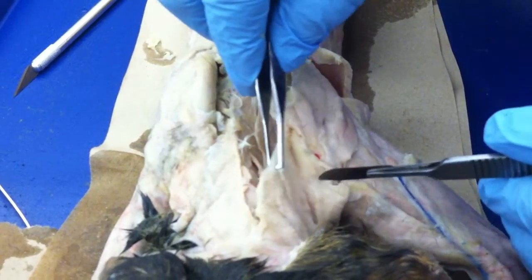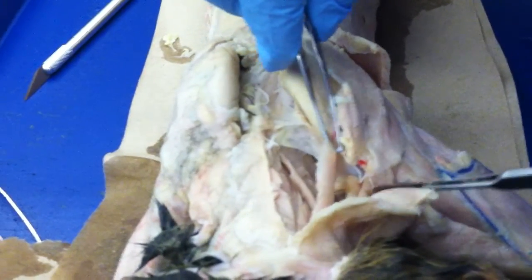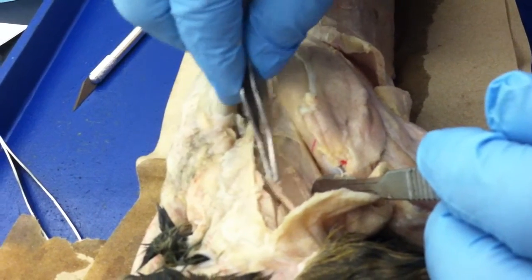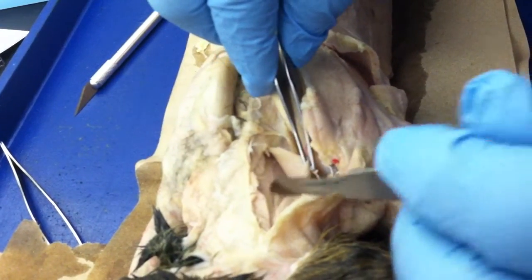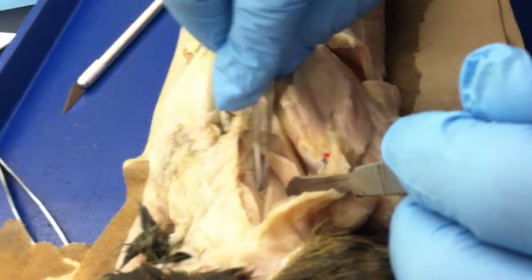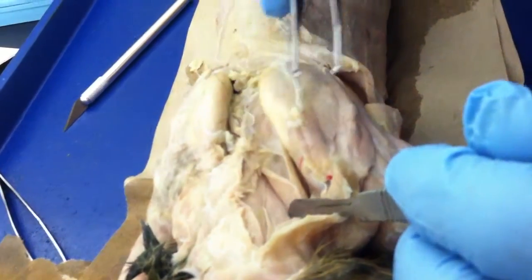We got right here the clavotrapezius, there's the rhomboideus capitus, right here is the splenius — I cut it and raise back the splenius. The divider above the forcep is the biventer cervicis, below is the complexus.